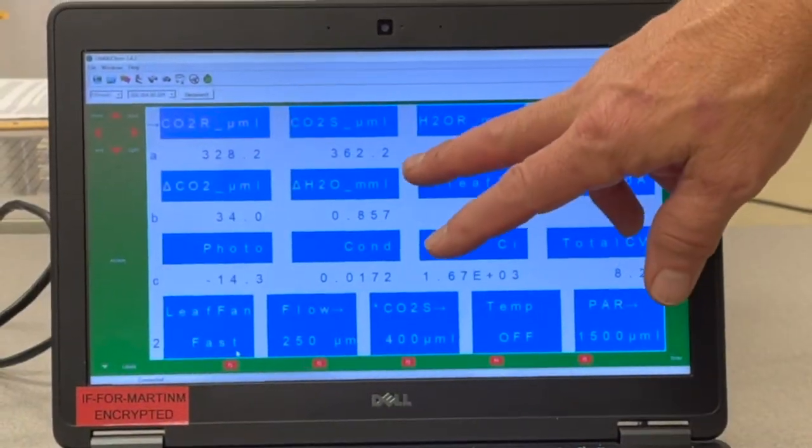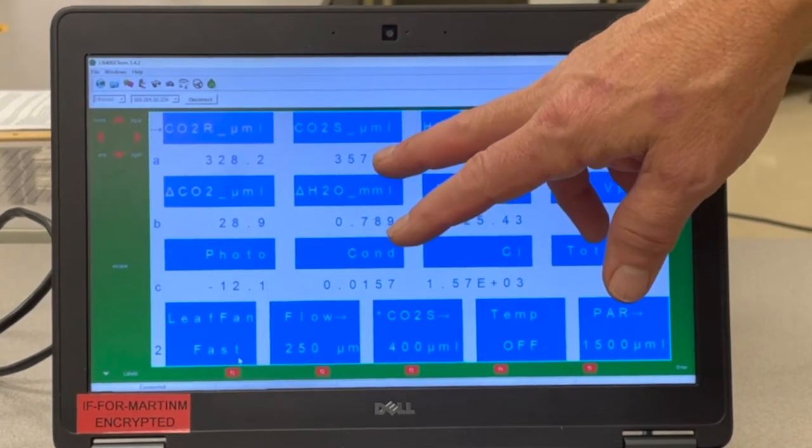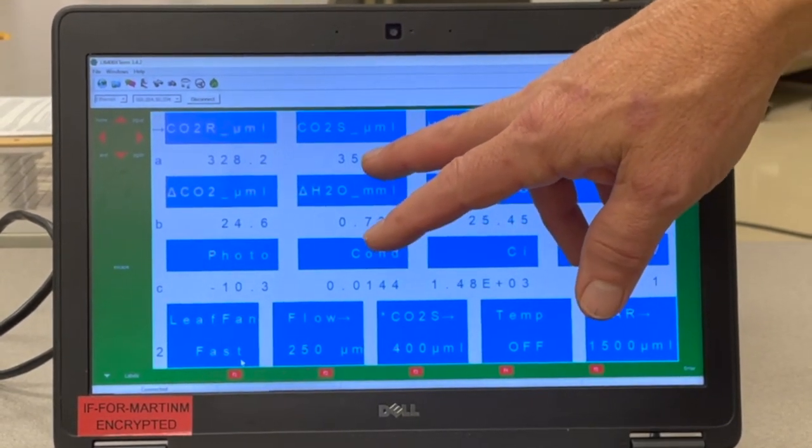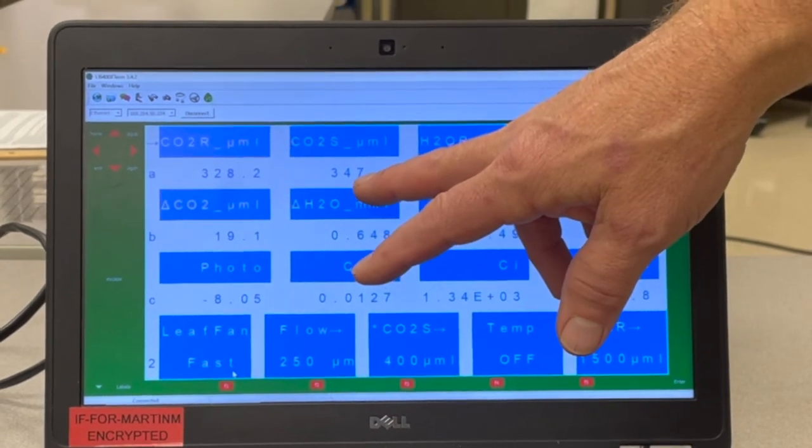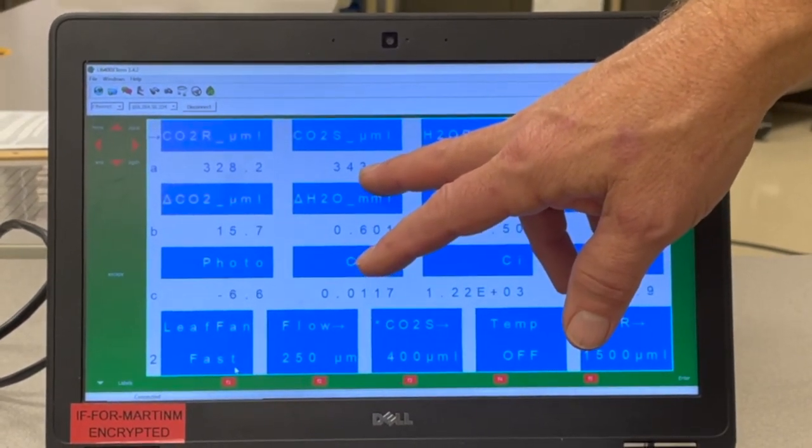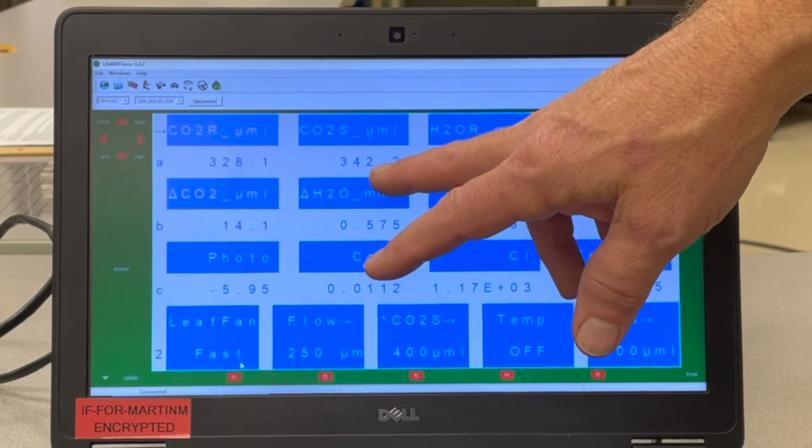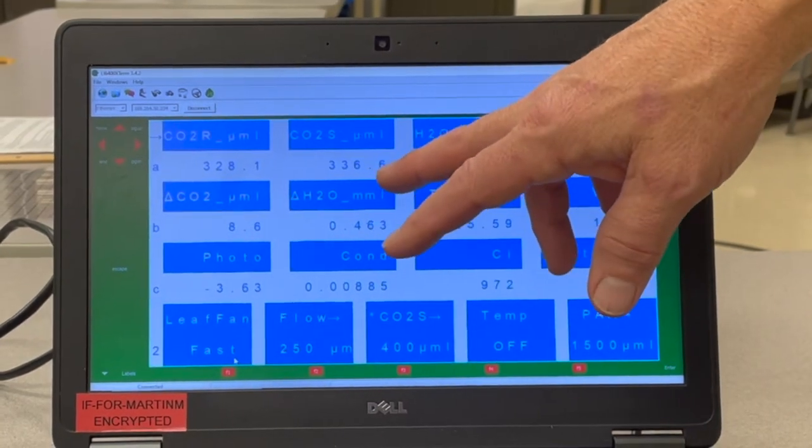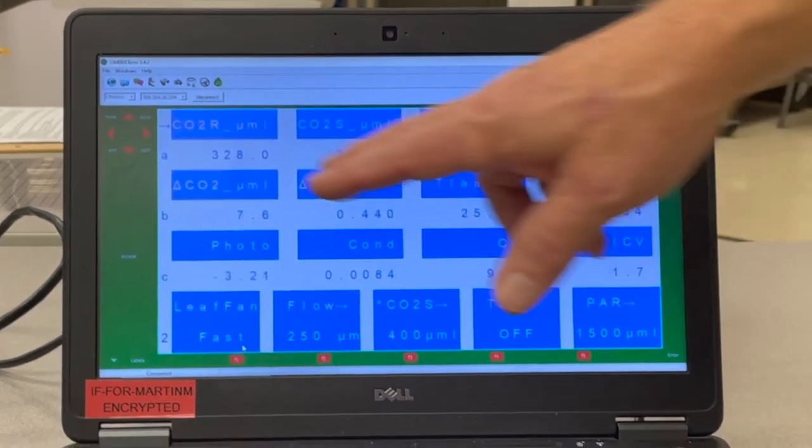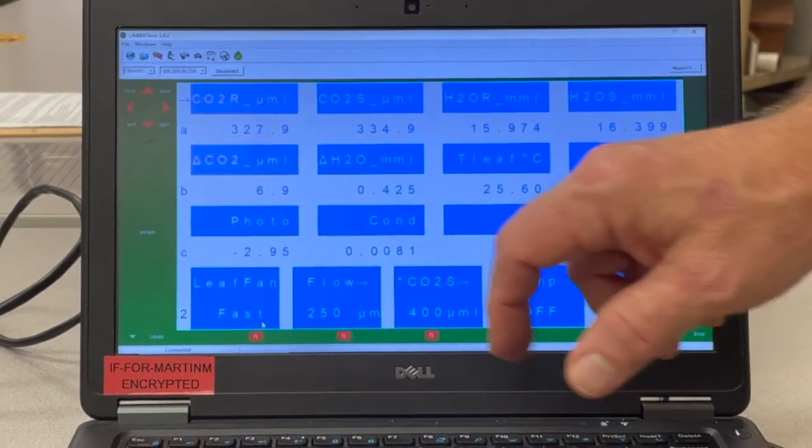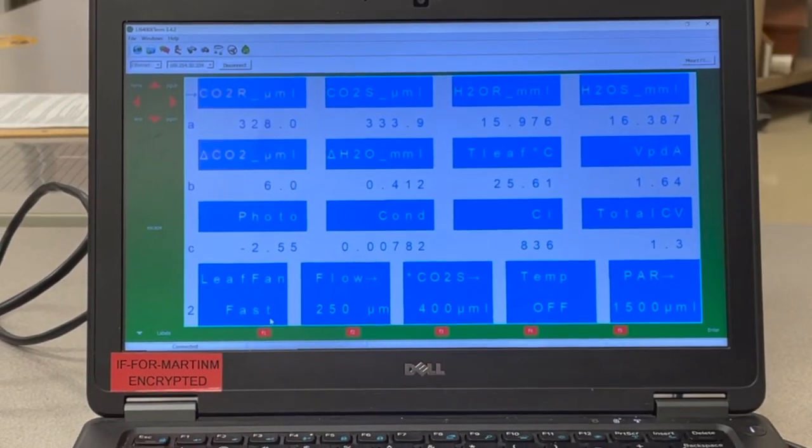What we'll be able to observe is that as the leaf photosynthesizes, it's going to pull that CO2 sample concentration down. Once it equilibrates, that CO2 sample number will be below CO2 reference, and we'll get a calculated net photosynthesis rate.